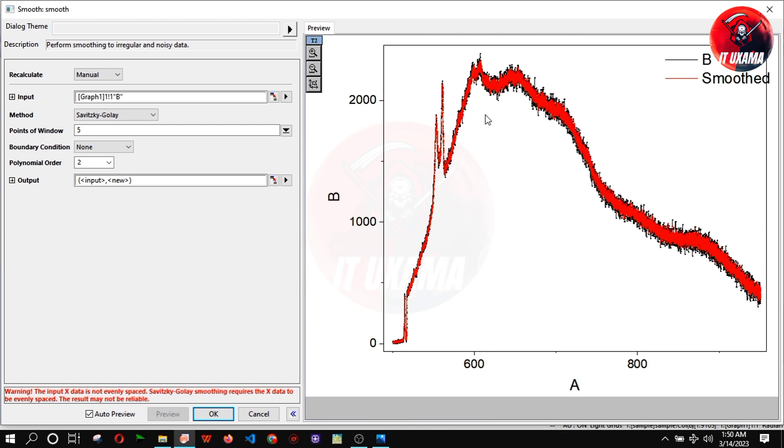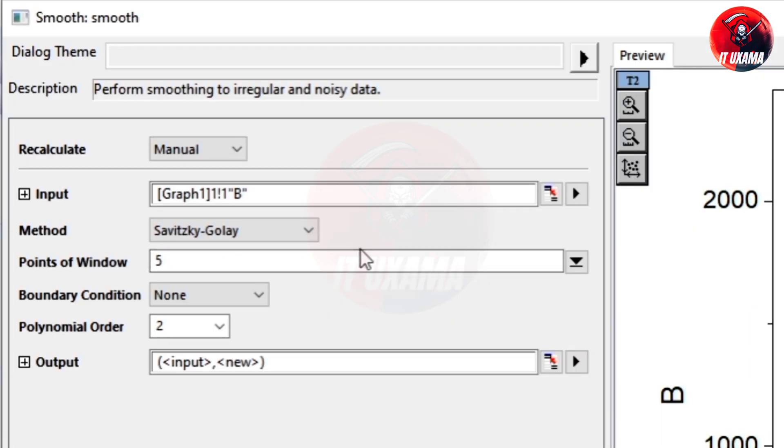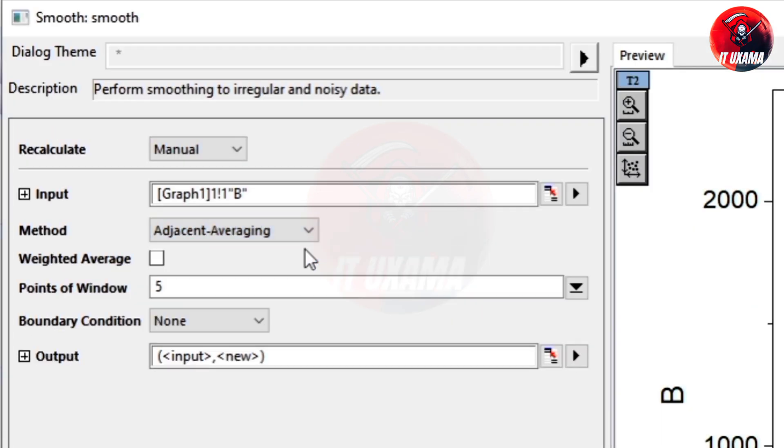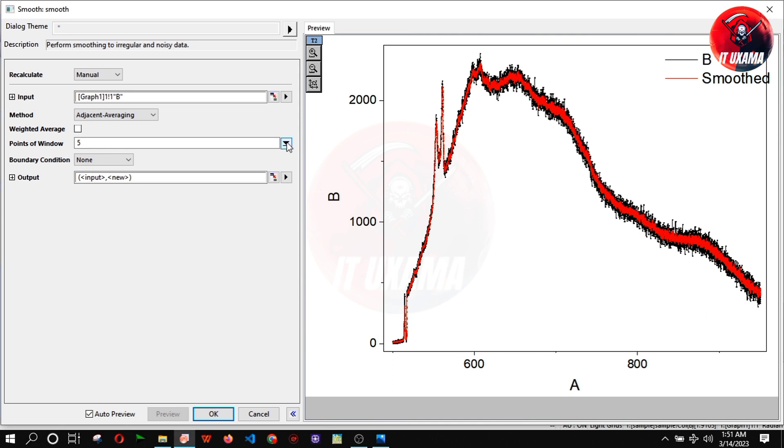Black curve is original data while red one is fitted curve. Now change method to adjacent averaging and increase points of window.